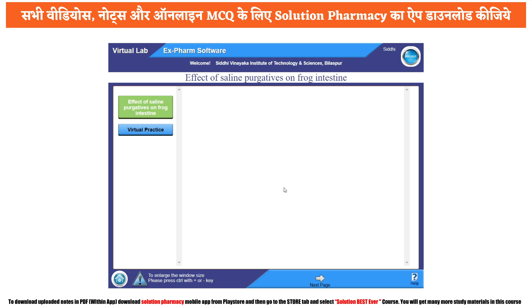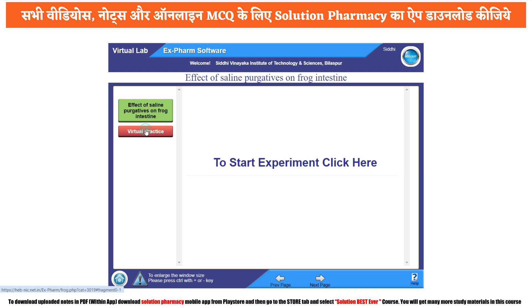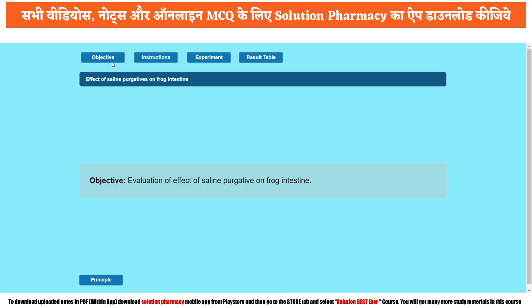Let's start the practical by following basic instructions. In the xform software you can see the basic interface — that is 'virtual practice.' Click on that particular tab. After clicking, you will get a tab that says 'click here to start the experiment.' Now the practical is started. On your screen you can see the following headings: objective, instructions, experiment, and result table.